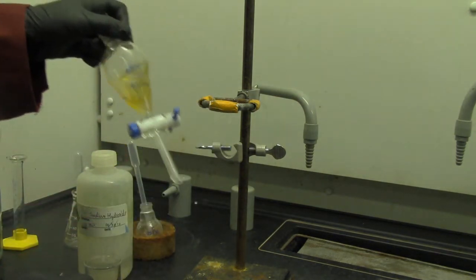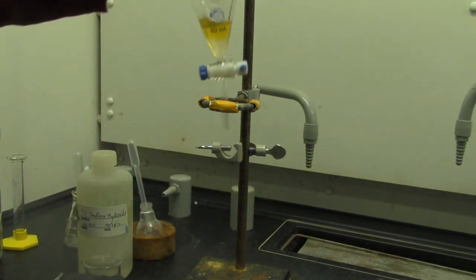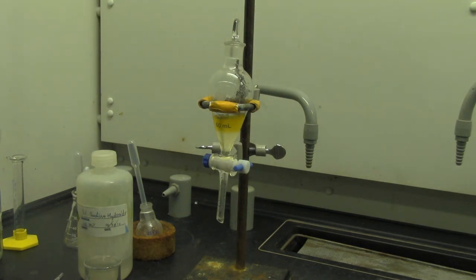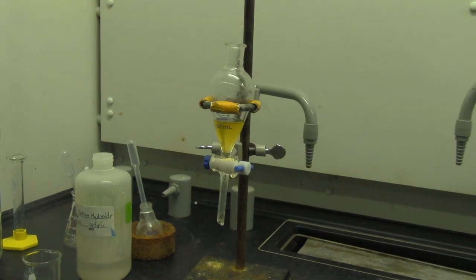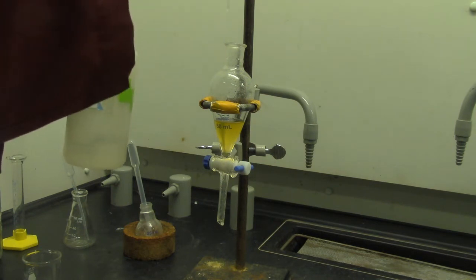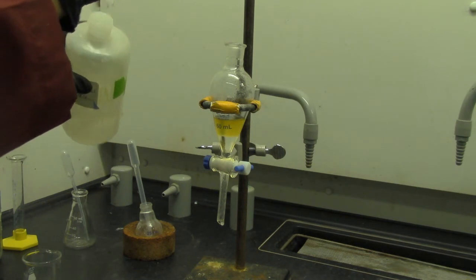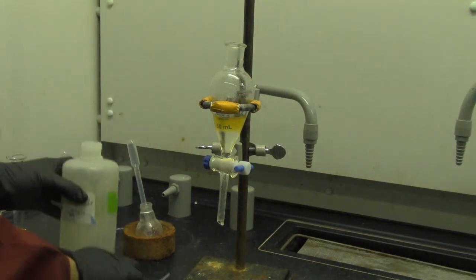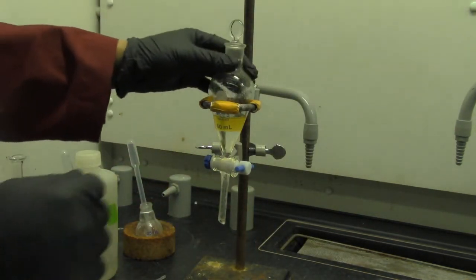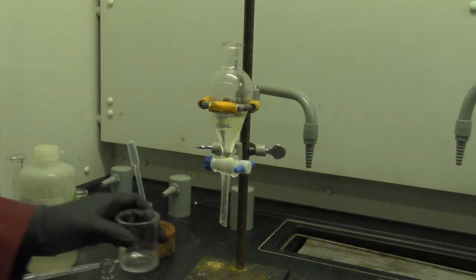So you shake it, swirl it, and then release the pressure. So this is good enough. Okay. Put it back here. It will form two layers. So I'm going to do it a second time, again with 5% sodium hydroxide, 4 ml. This is good enough. Shake it again. So now this is a second extraction.